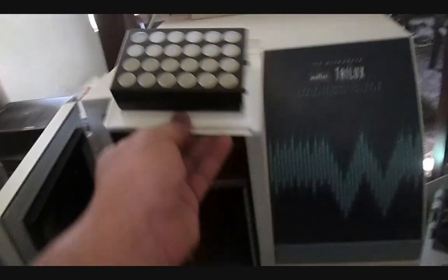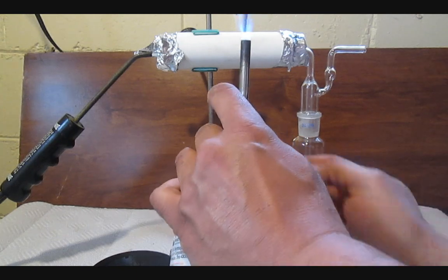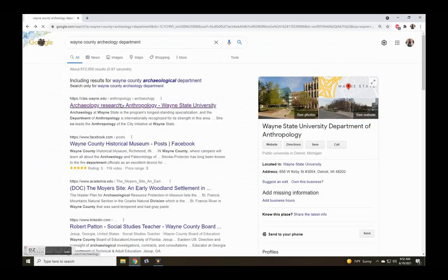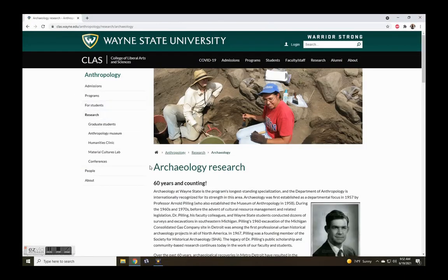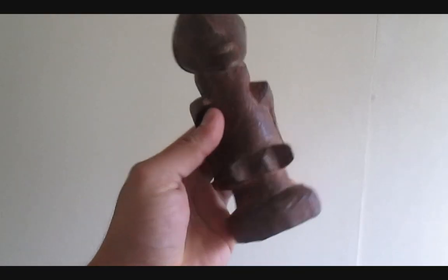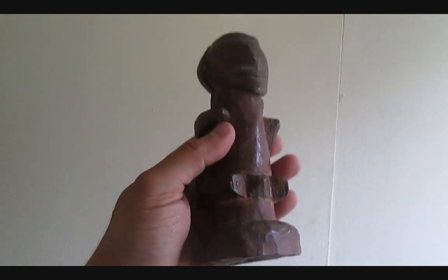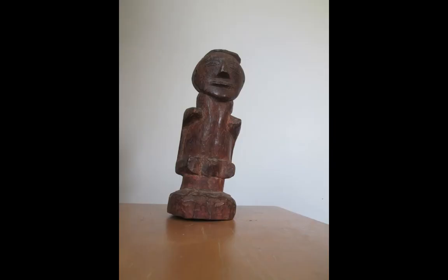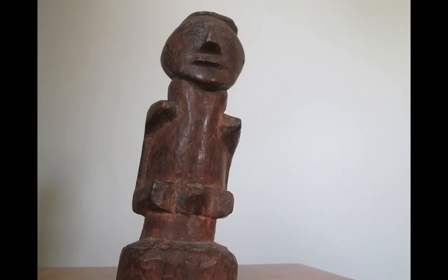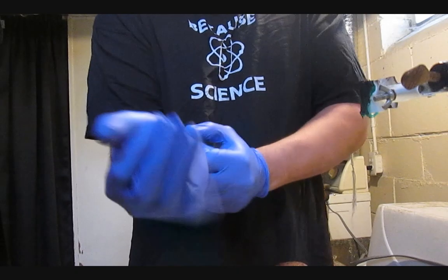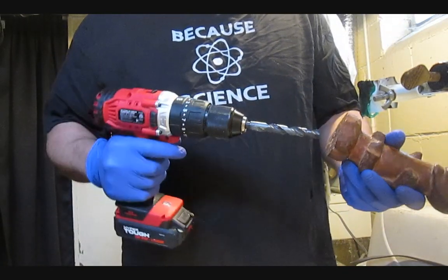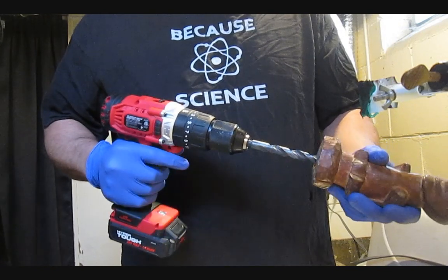To test this equipment and my method, I wanted to try dating a sample a few thousand years old. I contacted archaeology departments and museums in my area, but none were willing to donate anything. I found this small wood statue of unknown origin. The eBay seller claimed his father purchased it in the Philippines in the 50s as an already old item. Though I can't imagine this to be over 100 years old. Carbon dating is a destructive method of analysis, and I really hate to vandalize this icon, so I did the best I could for science.